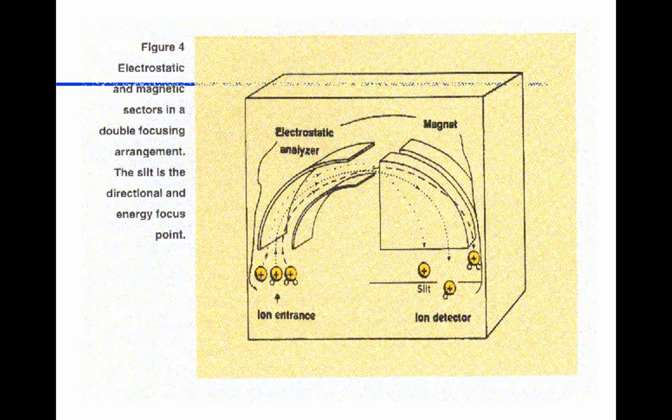And again, all of you know the right-hand thumb rule from physics, right? That an electrical particle moving through a magnetic field, and the field's going this way, and it pushes the force that, never mind. Anyway, it works. So we get our positive. I'm not sure if I was pointing in the right direction anyway. So anyway, we have positive.